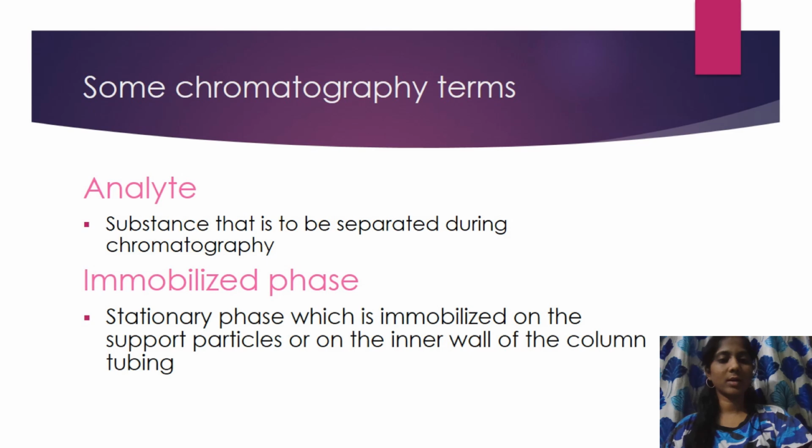Some chromatography terms: analyte, the substance that is to be separated during chromatography. Immobilized phase, the stationary phase which is immobilized on the support particles or on the inner wall of the column tubing.